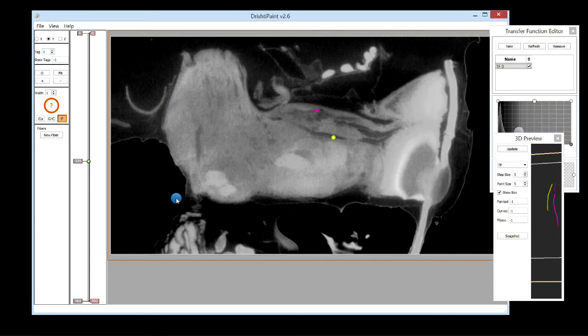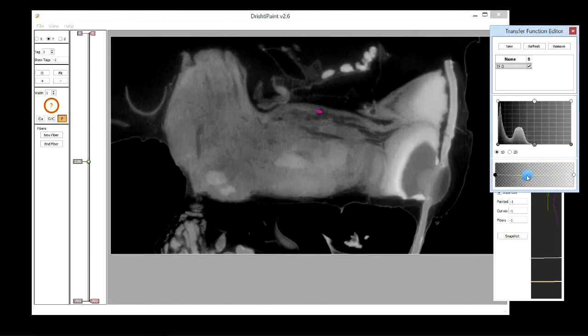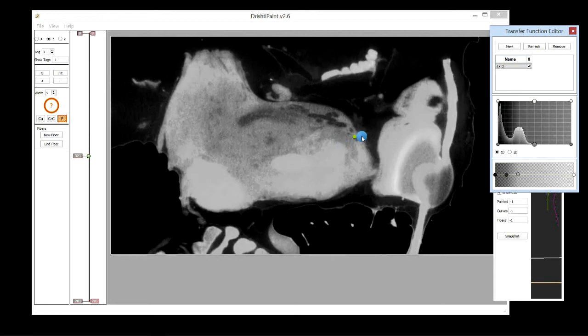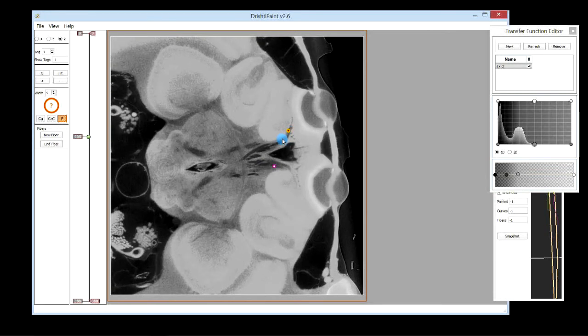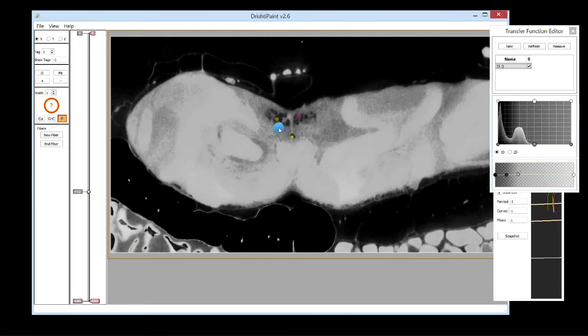Let's select another tag, new fiber. Okay, so let's have a new fiber. Say one from here. It will by default take width as 5, and this is the current fiber.